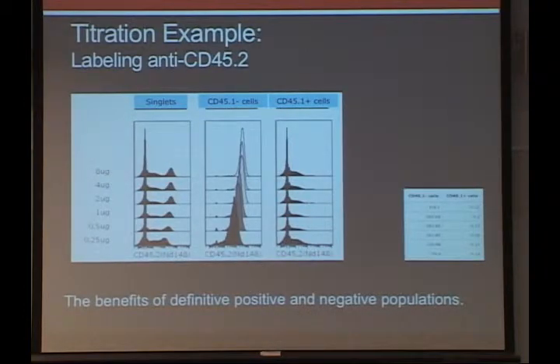I'm working primarily in mouse, most conducive to the sorts of questions I'm interested in asking. And if any of you have read Sean and Aaron's Science paper, you'll know that a lot of the work that's been done previously on mass cytometry is in humans. So these are all new reagents that I'm working on.